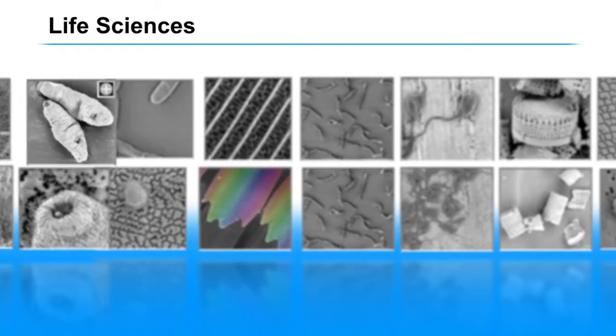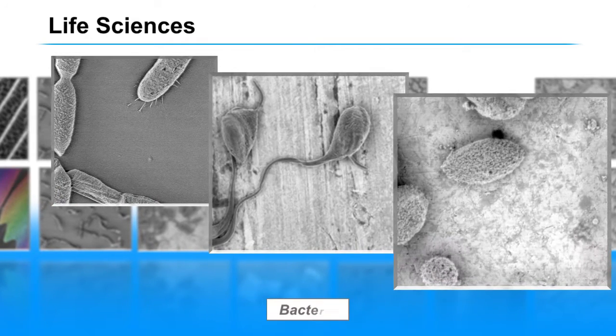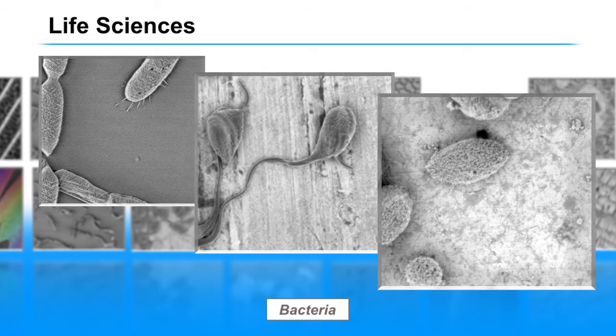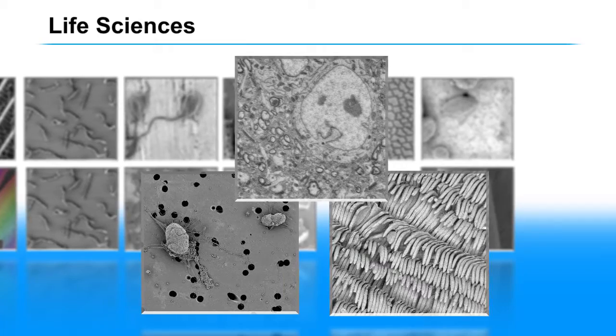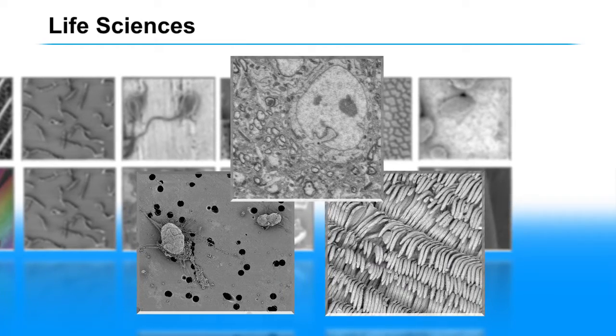The same holds true for bacteria or viruses or other potentially interesting biological samples where the point of interest is really the small features on this larger structure. Sample preparation is very simple. It requires just a dehydration and then looking at the sample in its natural state.